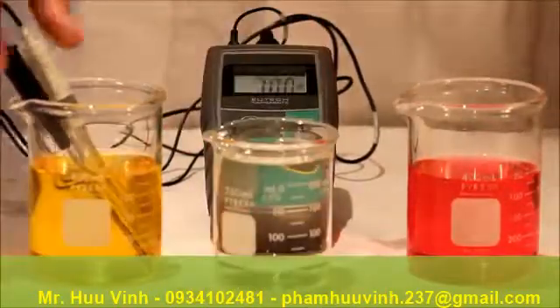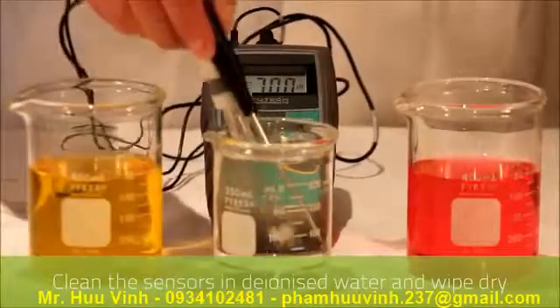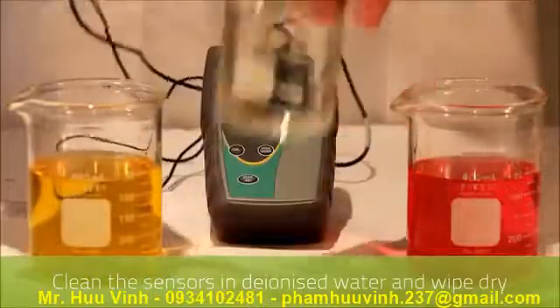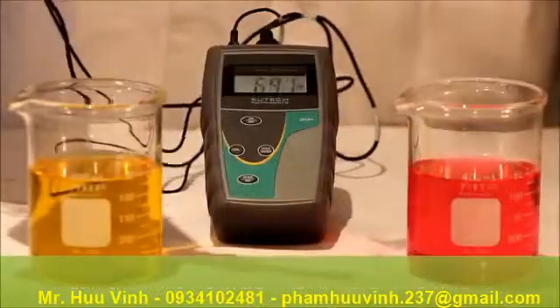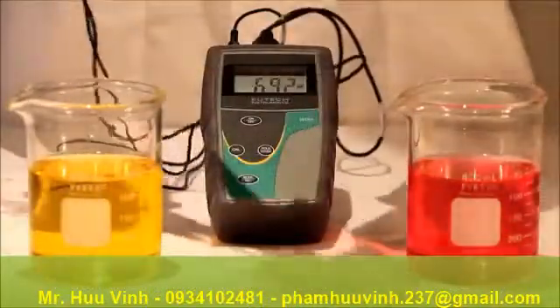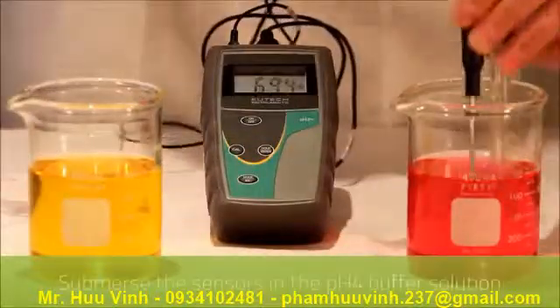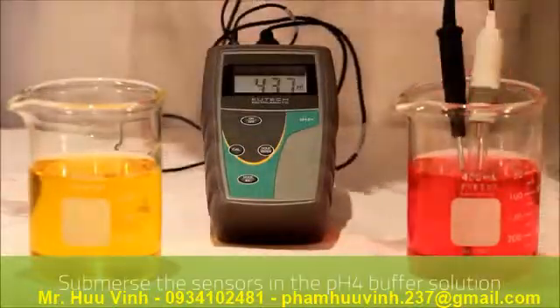Now we clean both sensors in deionized water and then wipe down with a soft tissue. Then we submerse the two sensors into the 4 PH buffer.